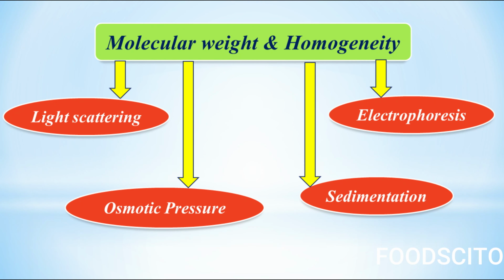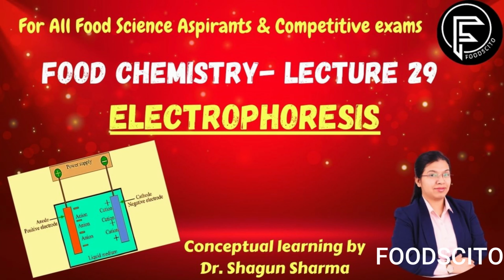Whenever we talk about molecular weight of proteins, it can be determined using a number of techniques, namely light scattering, osmotic pressure, sedimentation and electrophoresis. Amongst these, electrophoresis is the most commonly used technique. So in today's video, I'll be discussing electrophoresis in detail.